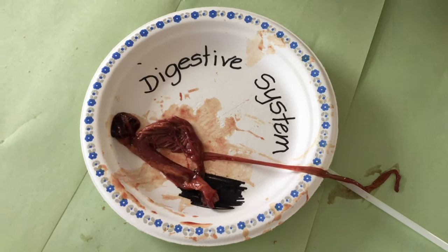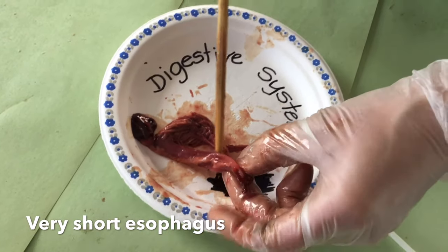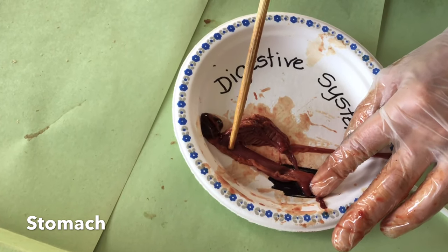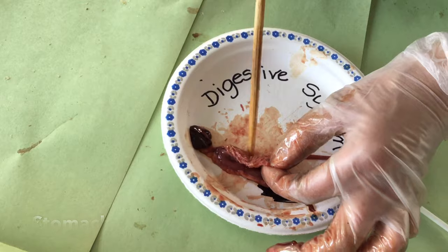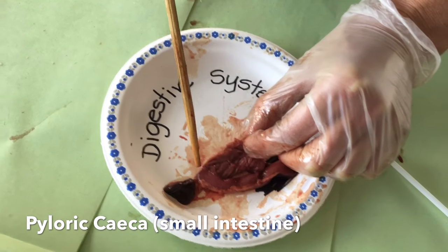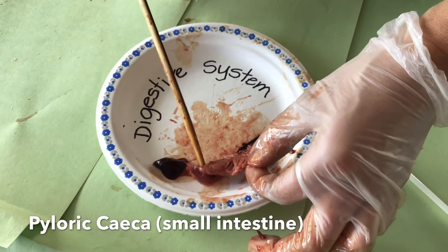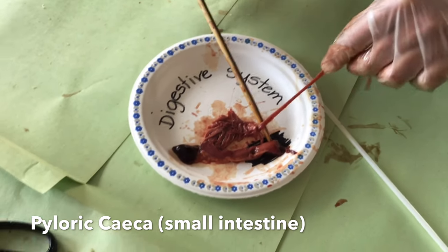Okay, so the first part, the esophagus, and I don't even know if we can see the esophagus. It is very short on the salmon, unlike our esophagus, which is much longer, because it's further to go. We can't see it. The stomach. This animal is indicating where the stomach is. And now the pyloric caeca, aka small intestines. That was a very huge Latin type word. They serve the same function as our small intestines, where they are absorbing nutrients or molecules from the food that you have eaten and has gone through all the first stages of digestion.